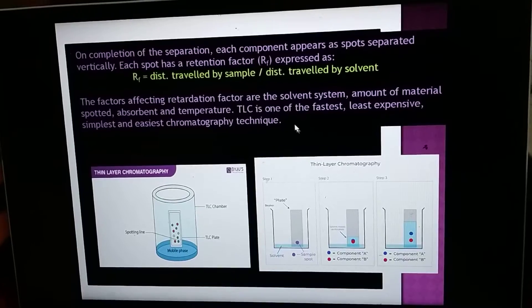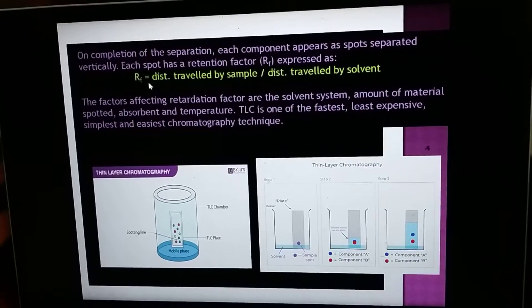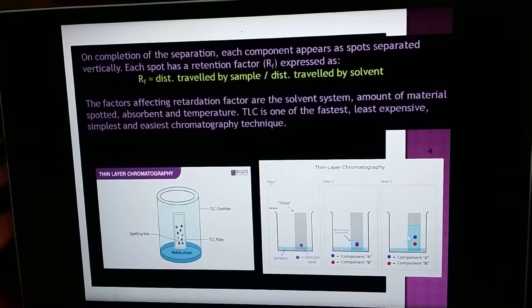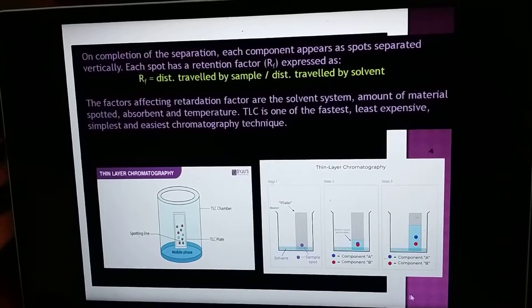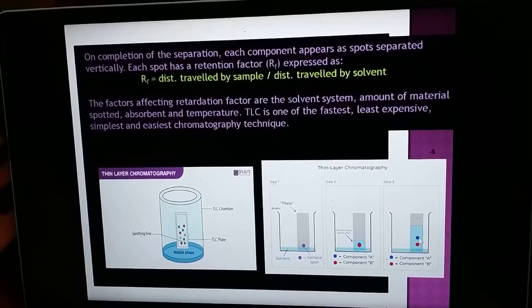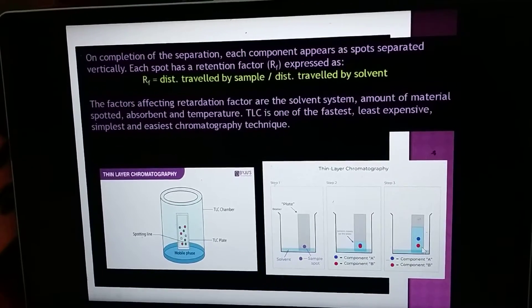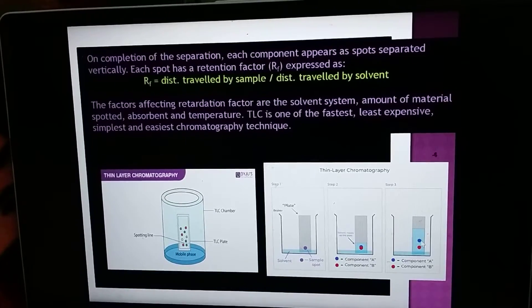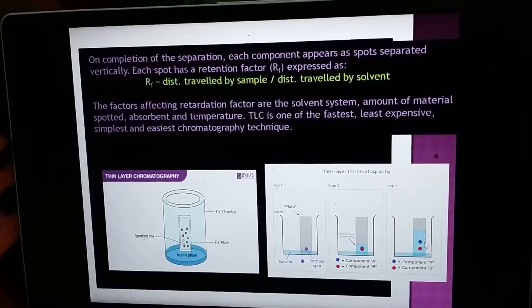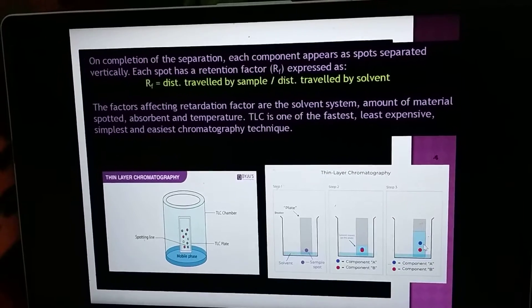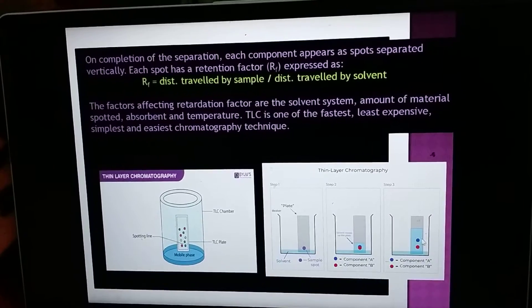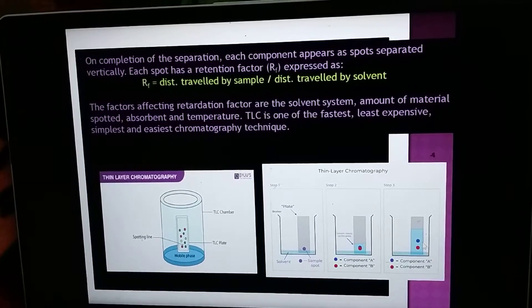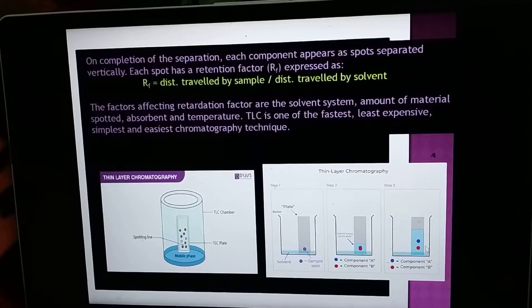Each spot has its own specific RF value, also called the retention factor. The RF value is calculated as the distance traveled by the sample divided by the distance traveled by the solvent. You measure from the baseline to the spot for the sample distance, and from the baseline to the solvent front for the solvent distance.